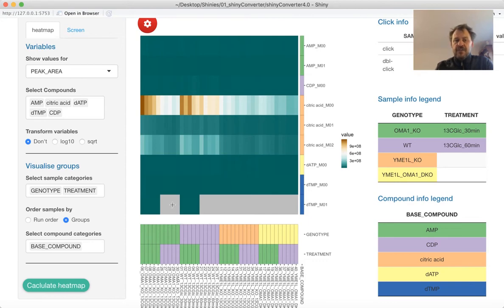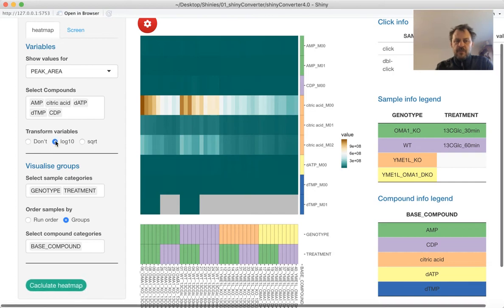We've got actually two groups here that have measurements, and all the others that don't have. And for that reason, this compound wasn't chucked out. Whereas if we had lots of compounds with lots of NAs, then we wouldn't have this blocky pattern. We wouldn't have any solid green blocks or other colored blocks. You can also log to make it look nicer.